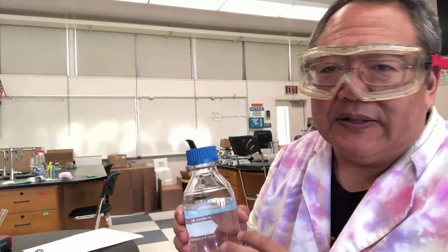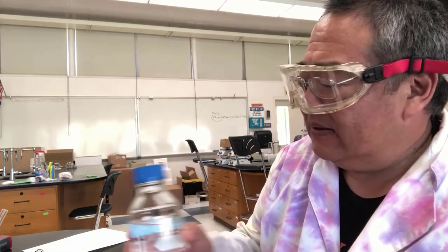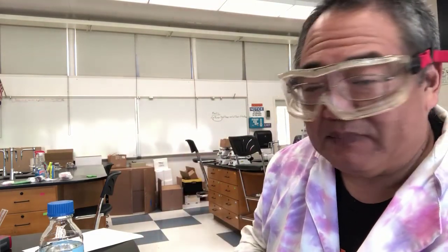These are made from very concentrated materials typically, and so what's actually in this bottle is not that expensive to get rid of, okay? So it's easy for us just to get rid of it and not worry about cross-contamination issues and things like that. So if you get too much by accident, don't put it back in the bottle. We'll figure out a way to redistribute it, or worst case scenario, we'll just dump it. But if a bunch of you do that, then we'll run out of this material and it'll have to get remade. And again, that's a mistake not on us or the lab tech. It's really a mistake on whoever did that, and we'll all end up sitting around waiting for it to be remade so that we can continue with the experiment.